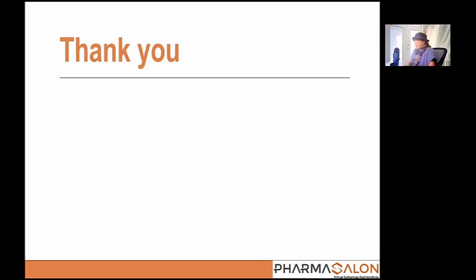Okay, excellent. I know there have been some proposed changes to 797, and I'm sure that we'll talk about this a little bit more. But are there any proposed changes that directly affect what you were just talking about? So not specifically. We didn't really talk about frequency of sampling, except generally that I'd love to see more sampling.